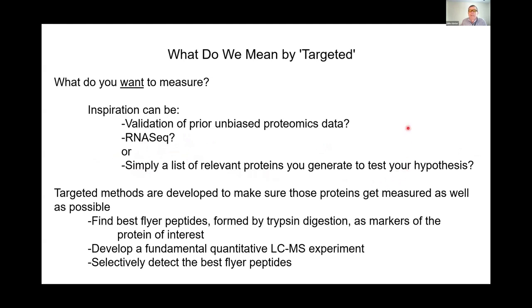This kind of started with some collaborations that I had, where people originally thought their treatment created oxidative stress, and so we set up a panel of proteins to measure the oxidative stress enzymes. Later somebody came to me wanting to look at the yeast kinetochore complex, and we put together a set of assays to measure those proteins.